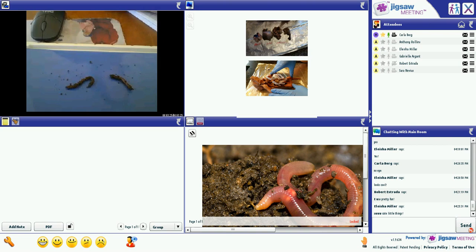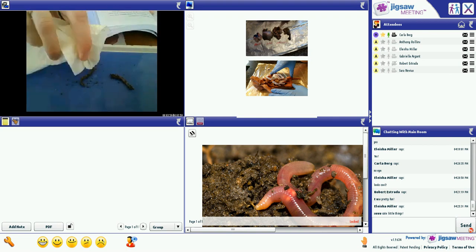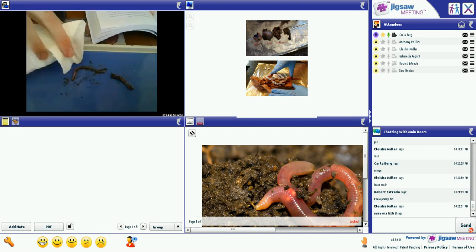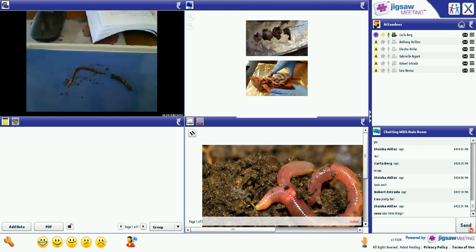Okay, we are going to try to find some structures of our earthworm. Now you're going to have to flip back to page 111 while we are doing this in order to identify them. I'm going to use my little probe to point things out to you guys. And I'm going to use my bigger earthworm here. First, I'm going to try to rinse some of the dirt off of him. Okay, now hopefully that will make it easier for you to see him. Now, unfortunately, he obviously is a worm, so he's not going to stay still.